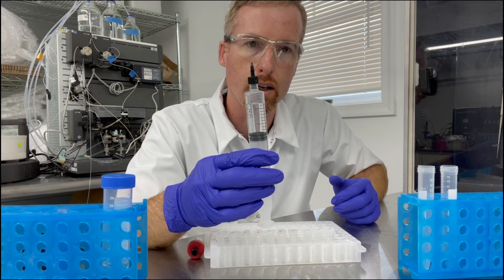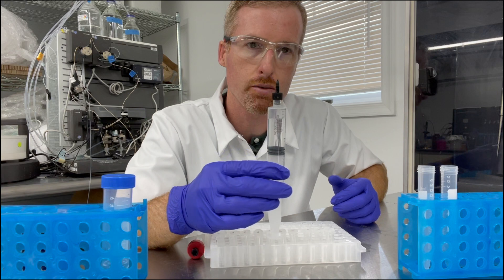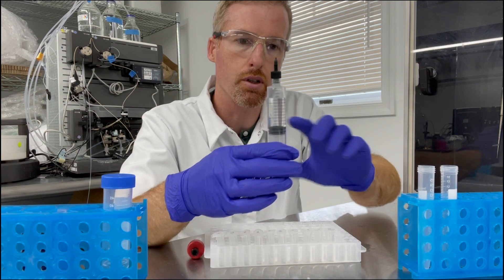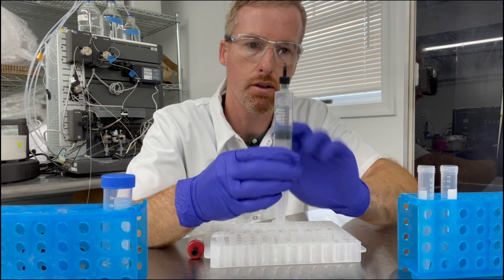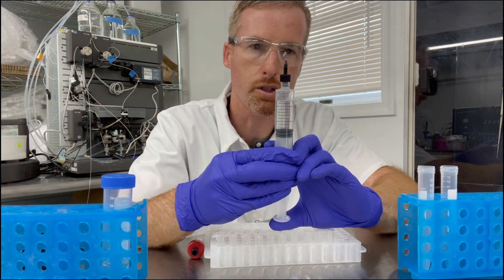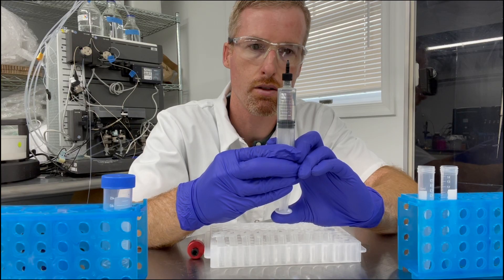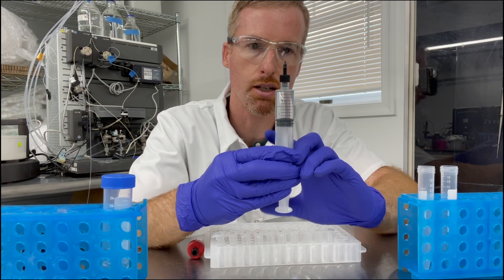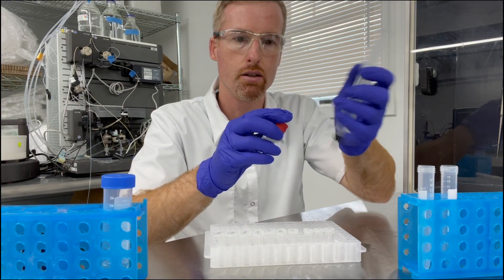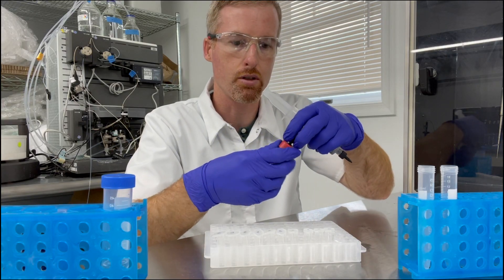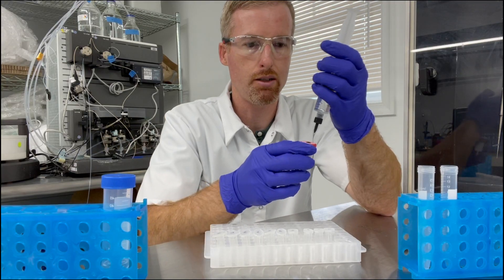Now you can see that I pulled up some air with my protein so I'm going to go ahead and turn the syringe upside down, tap it, and then force the air out until I see a little bit of liquid at the top. Okay, and then I'm going to go ahead and start flowing the protein into my column.